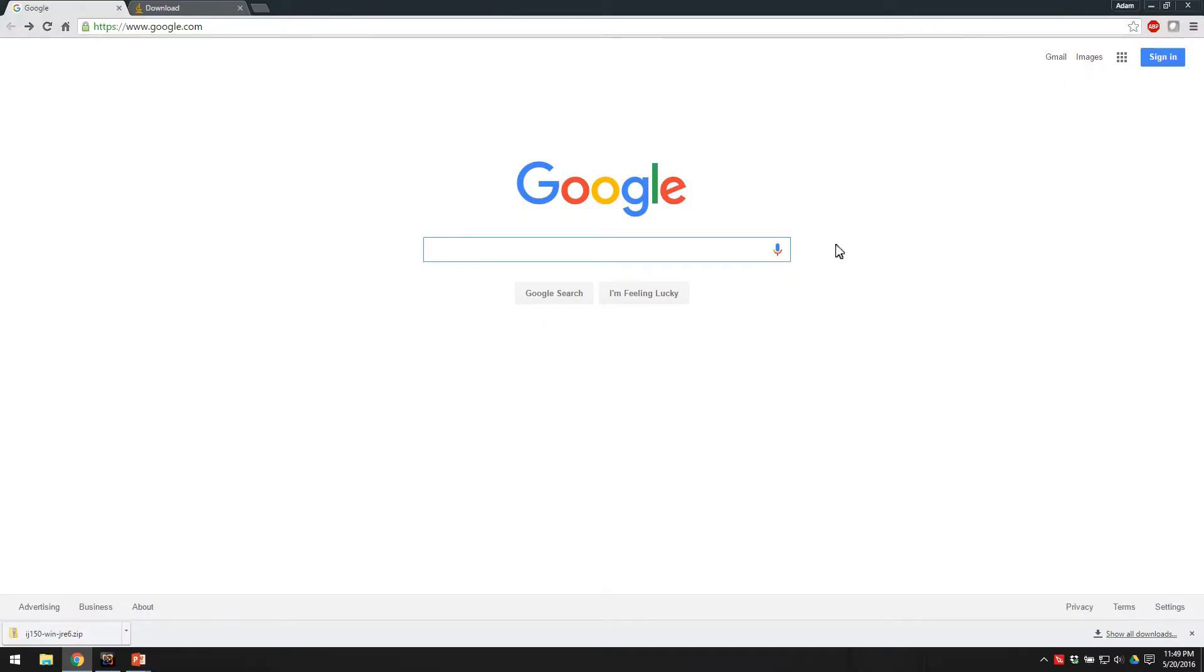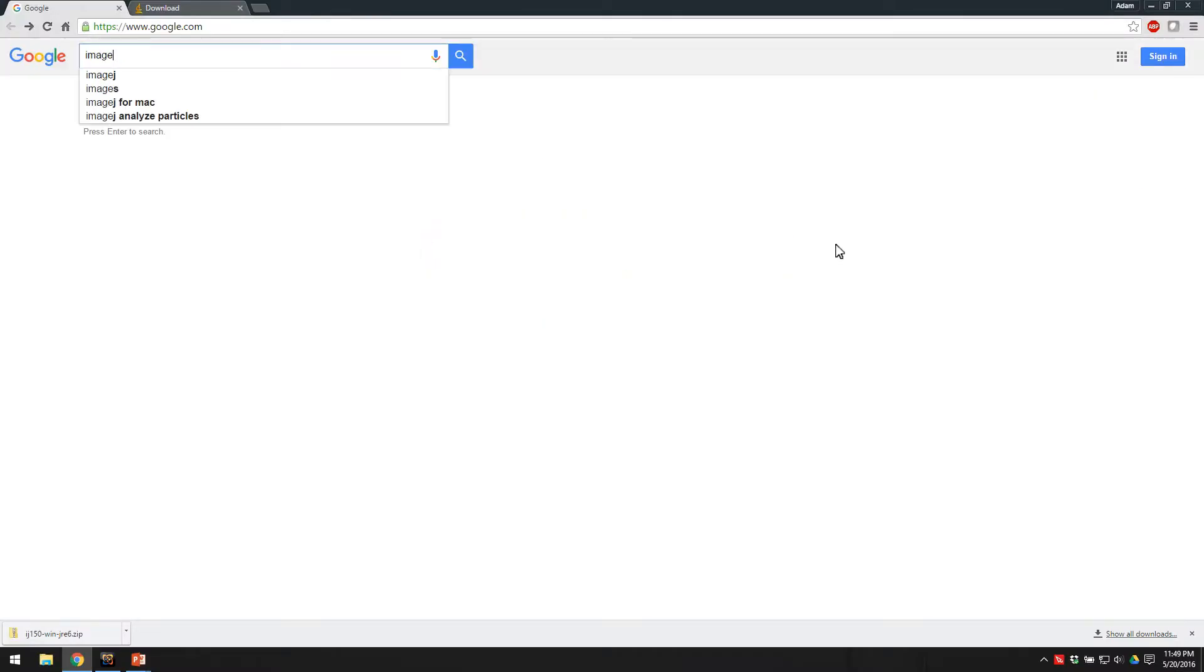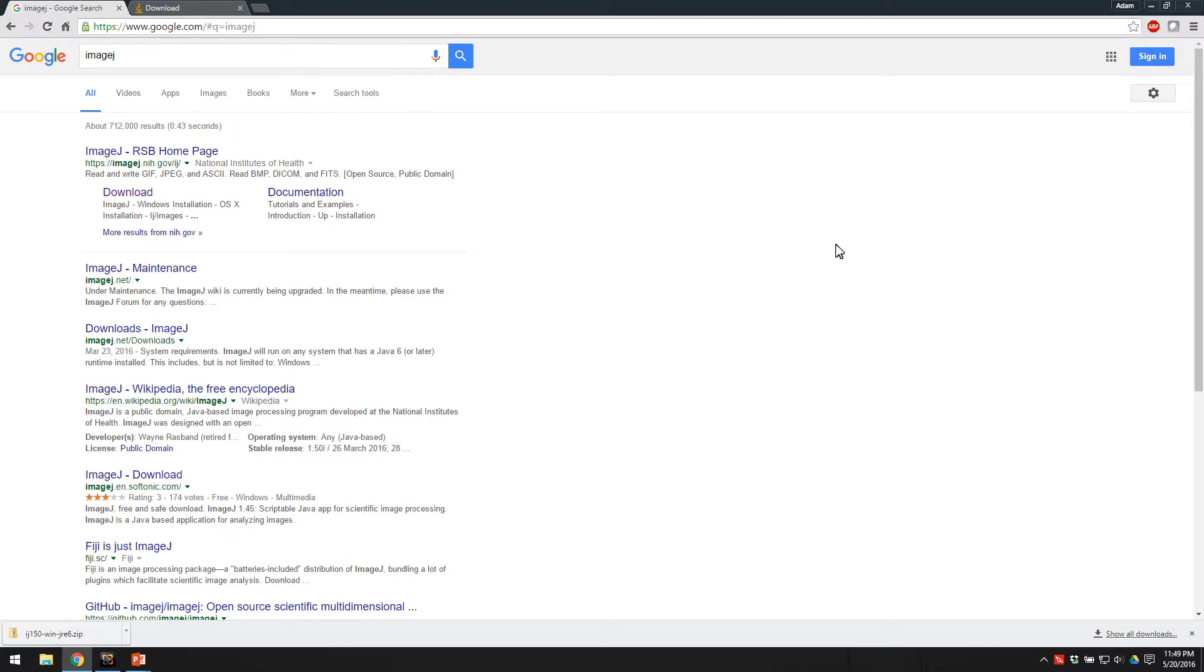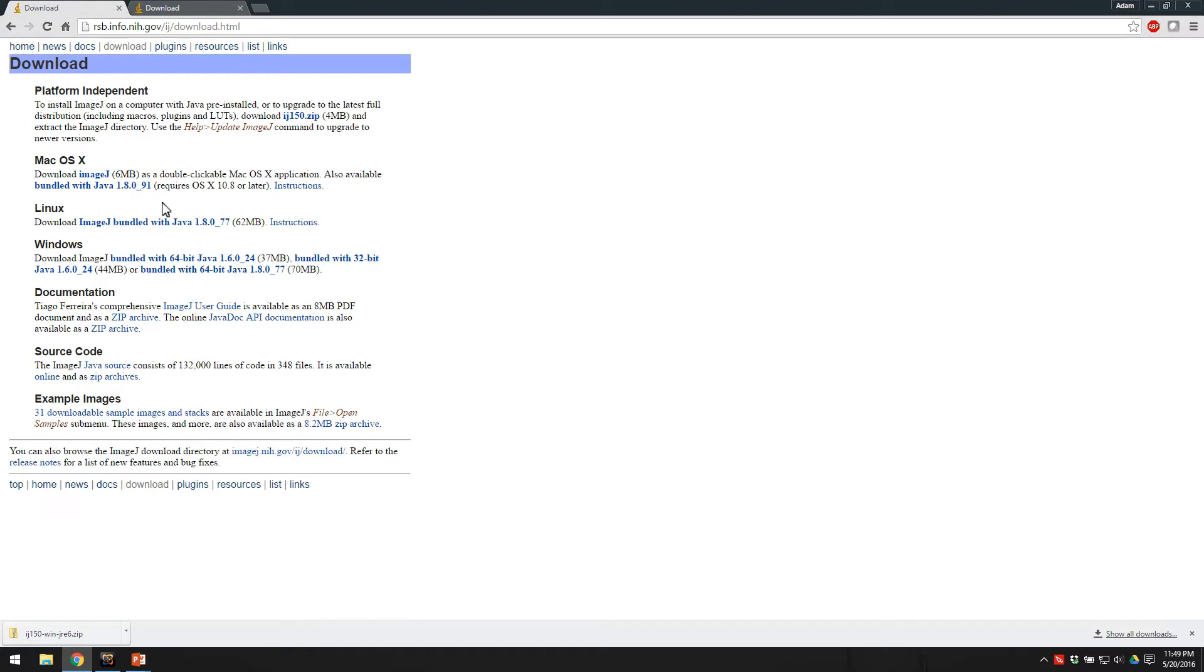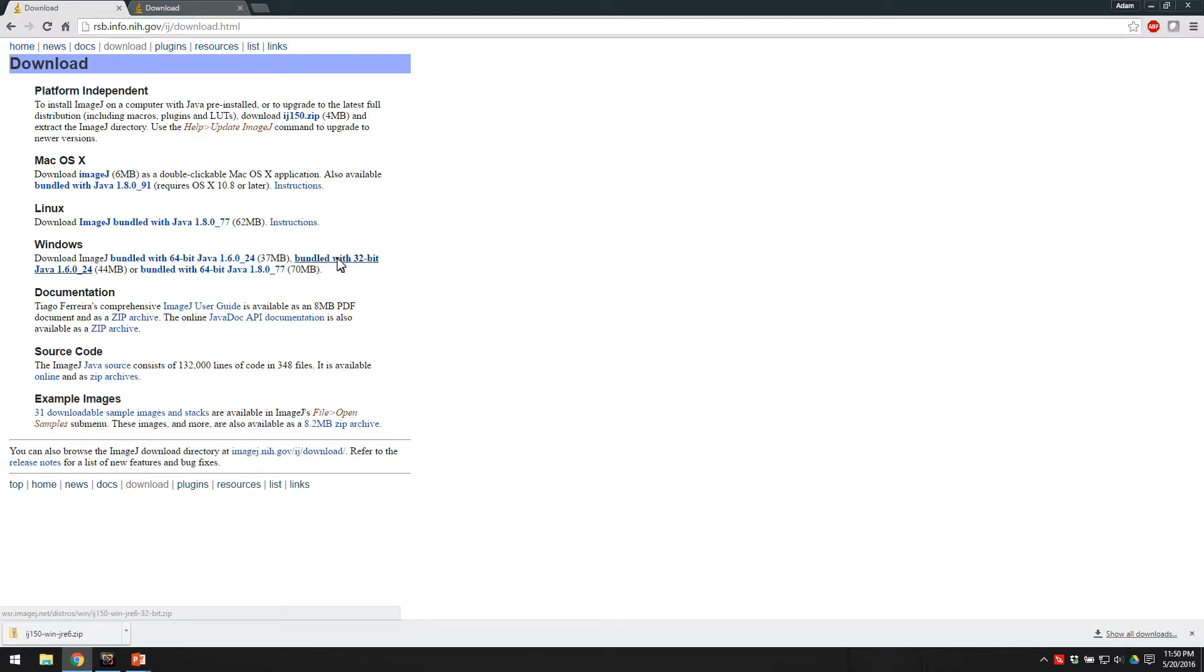You're going to start just by googling ImageJ, and you'll see that this first download link, you can just click that, and you can see each operating system here. For Windows, you can choose either 64-bit or 32-bit bundled with Java, and most versions are similar and will give you the same features that we need to do the essential tools, so you can really pick any of these. I'll just pick the first one for 64-bit.